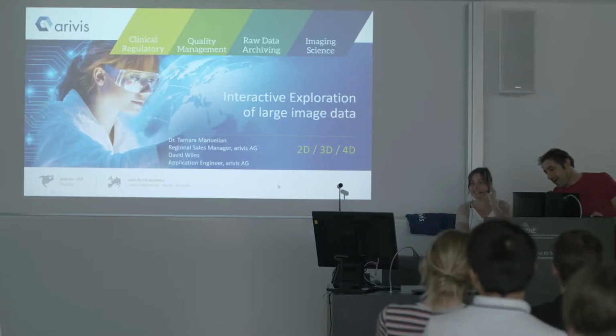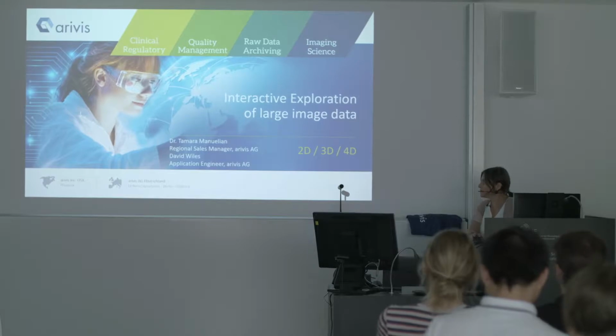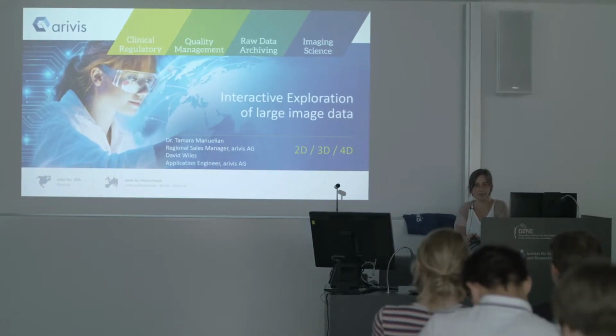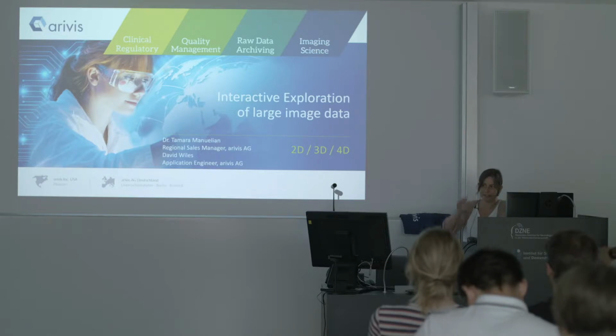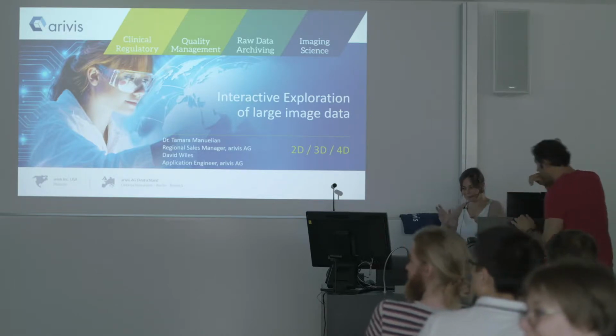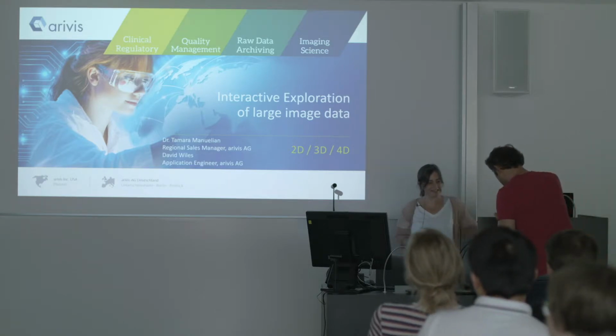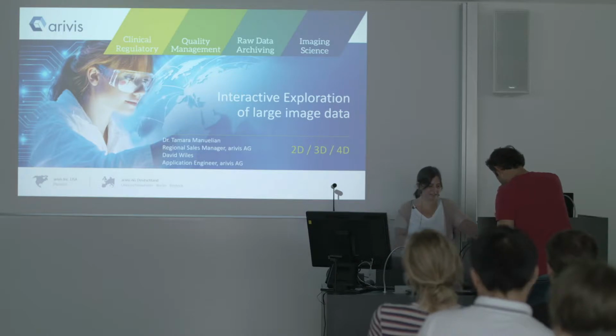I will be presenting some general slides using a presentation to give you a gross overview on what ARIVIS is all about. And then my colleague David, who's sitting in the back, and I are going to switch. And David is going to give you a live demo presentation.